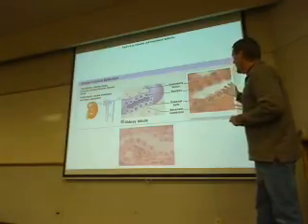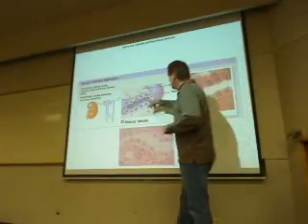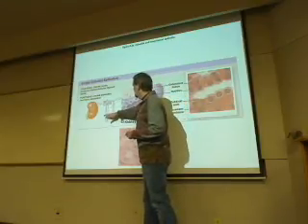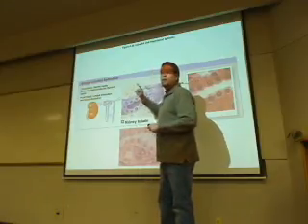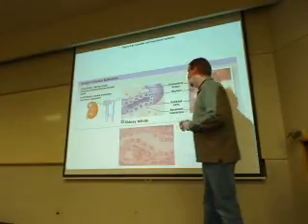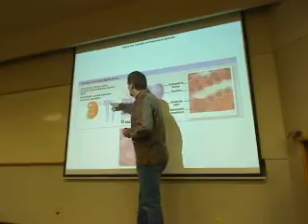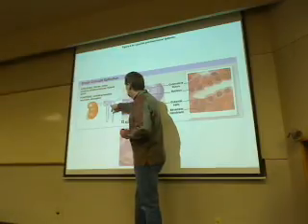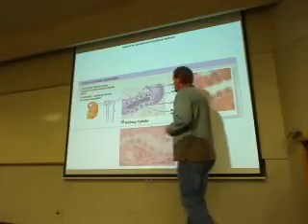Some absorptive capacity. In this case, in the kidneys, what will happen is these guys that are not showing it here will, at least in the first part of this structure called the nephron, you'll see quite extensive microvilli that will also be present here to help with that absorptive capacity. When you get down here towards the end of this tube, not nearly as many microvilli, and we'll also have secretion that will occur. So stuff will move from the outside of the tube through the cell into the tube in order to be secreted.